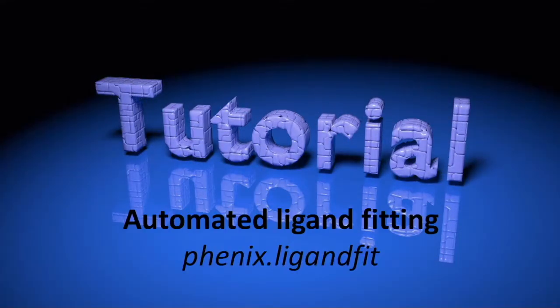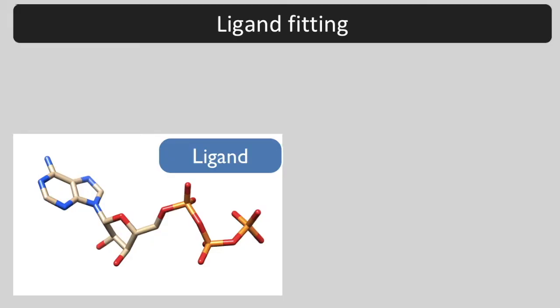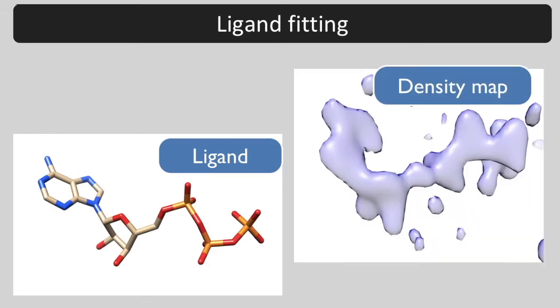Today we are going to learn about automated ligand fitting using ligand fit in the Phoenix GUI. The inputs to Phoenix ligand fit are a flexible ligand and a density map showing the ligand. The goal is to identify a conformation and orientation of the ligand that fits the map.